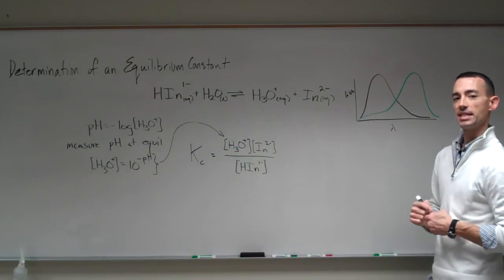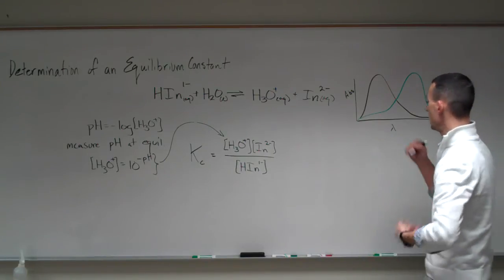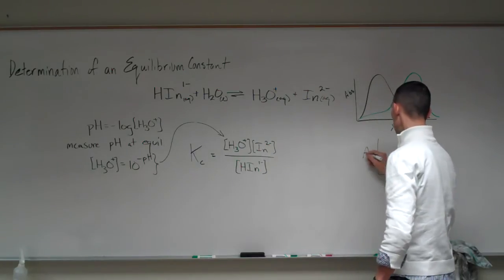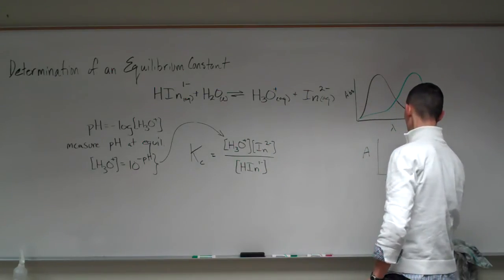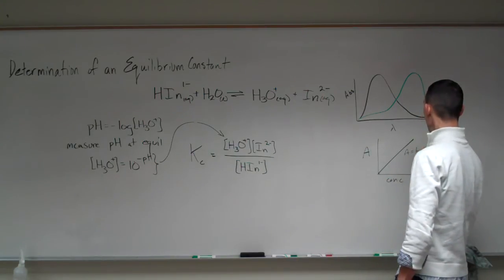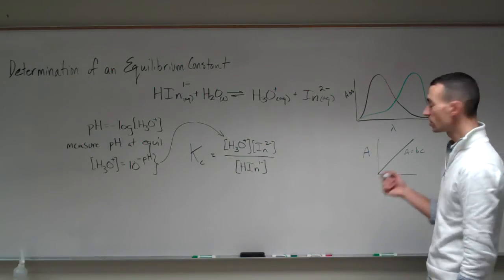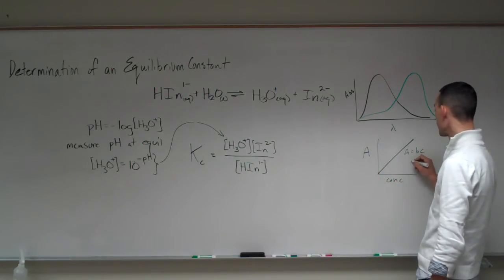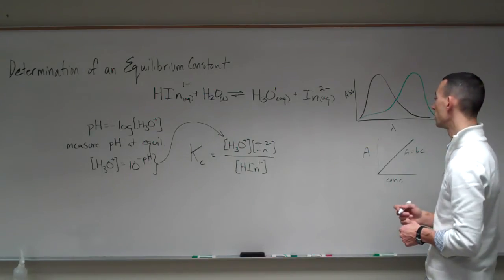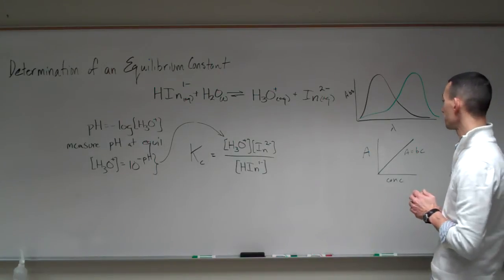At first glance, it might seem like, well, we could pick either wavelength then, and if we recorded data like we have in the past for absorbance versus concentration, we know that a linear relationship would exist. A equals BC. We could measure our unknowns and solve for the concentration from the absorbance. Beer's law, which we've used before. But which wavelength should we choose is the question.